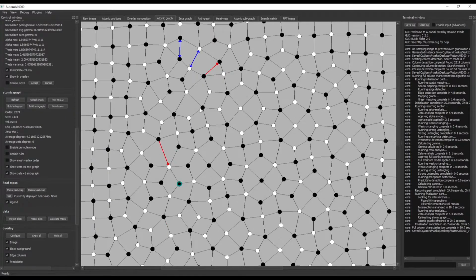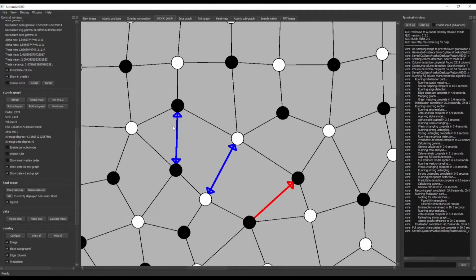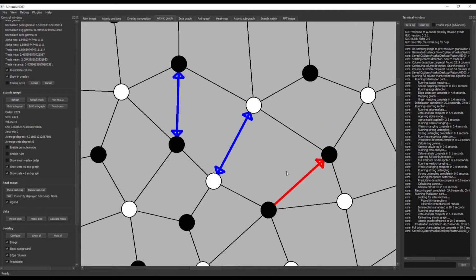Yeah, one final piece of the puzzle is up here. We see that this one should point there, this one should point there, this one should point, not sure actually.